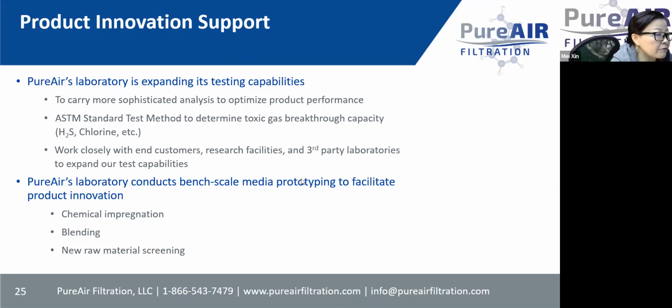Normally, I forgot the number, but it's several millimeters thick, maybe 2 or 3. And sometimes people use copper or silver lined on a base strip. So I think there is a minimum thickness of copper and silver needed on the coupon. I can't come up with a number. I think it's several microns.